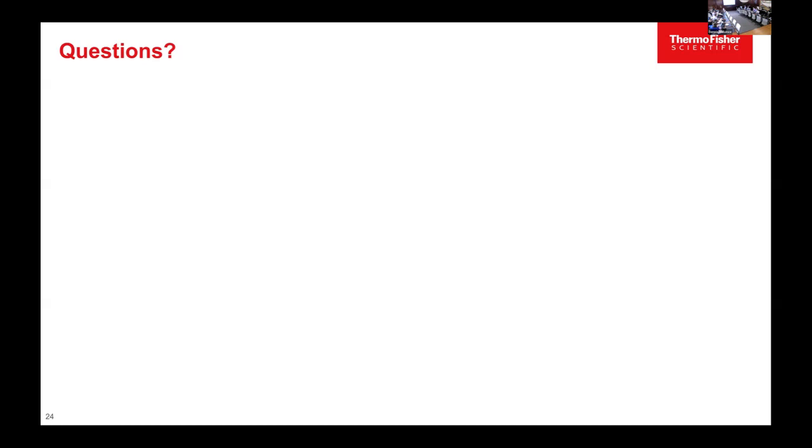Okay. I'm going to ask one more question, then I'll let somebody else. In the INFERYS list of modifications, are all of those available through Chimerys, or are those two independent lists? They're the same. So INFERYS is used in Chimerys to do the predictions of those spectra.